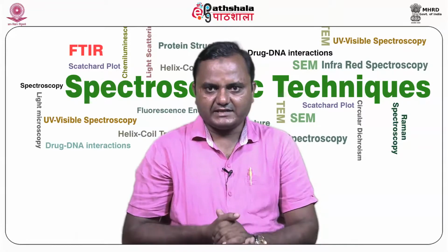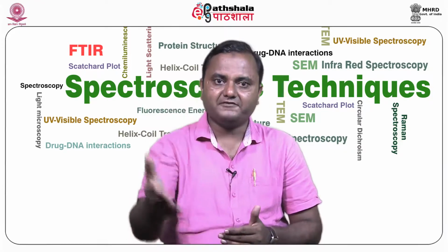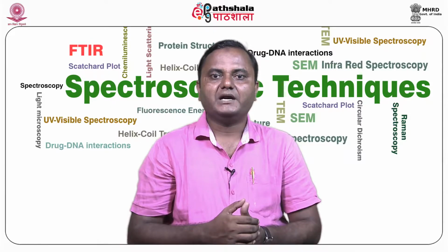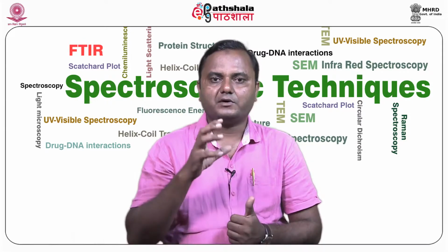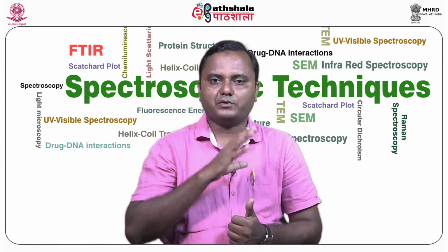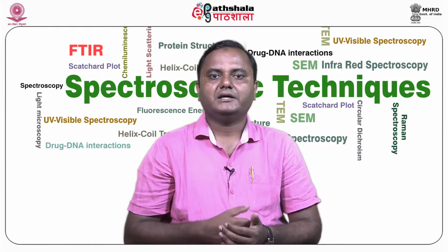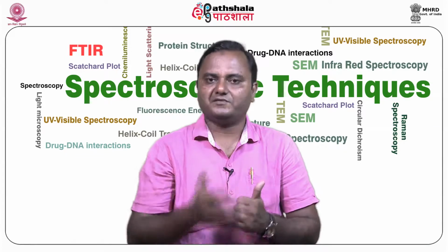So, light from the laser enters at the end of the cell and the scattered light exits at different angles. The scattered light is collected by multiple detectors. When using MALS, the Debye plot is completed and extrapolated back to 0, and the molecular weight is calculated from the intercept and the Rg value is calculated from the initial slope of the line.